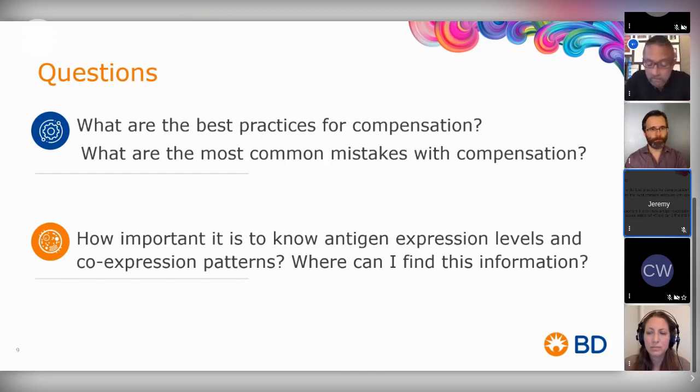Again, a really good question. I'd like to address perhaps one specific question before that, and it's about intracellular protein information as opposed to receptor density data on the surface of a cell.